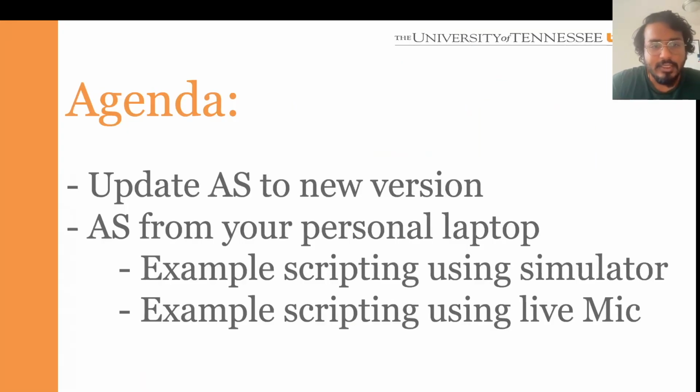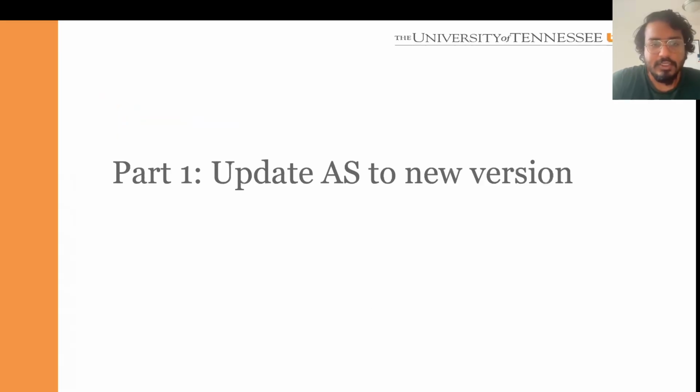And the agenda is, first we will update to a new AutoScript version. Recently I checked that they released the 1.15 version. So first we'll do that, and then we will set up acquisition for AS from your personal laptop, and we will run the same example of scripting using the simulator, and then we'll also do a little bit of live microscopy scripting today. So let's first jump into part one to update the AutoScript version.